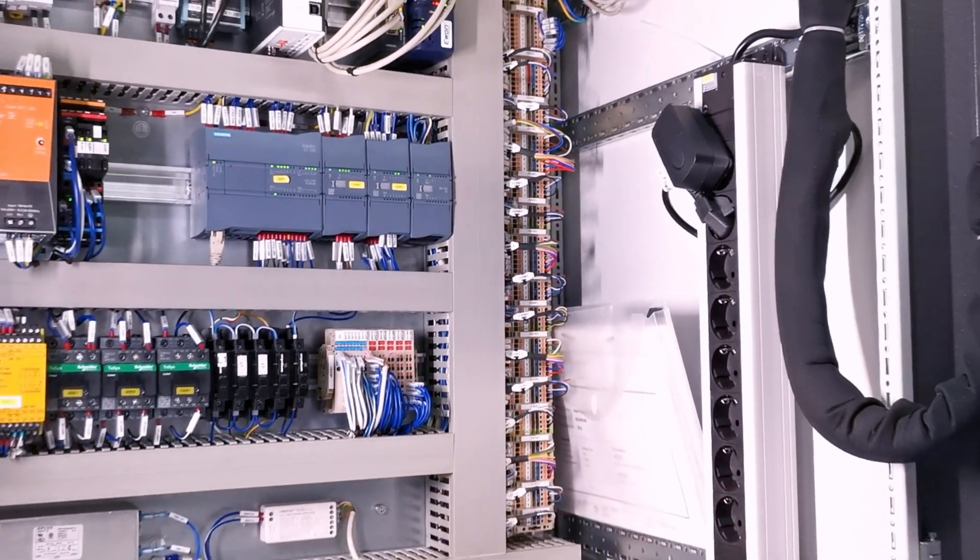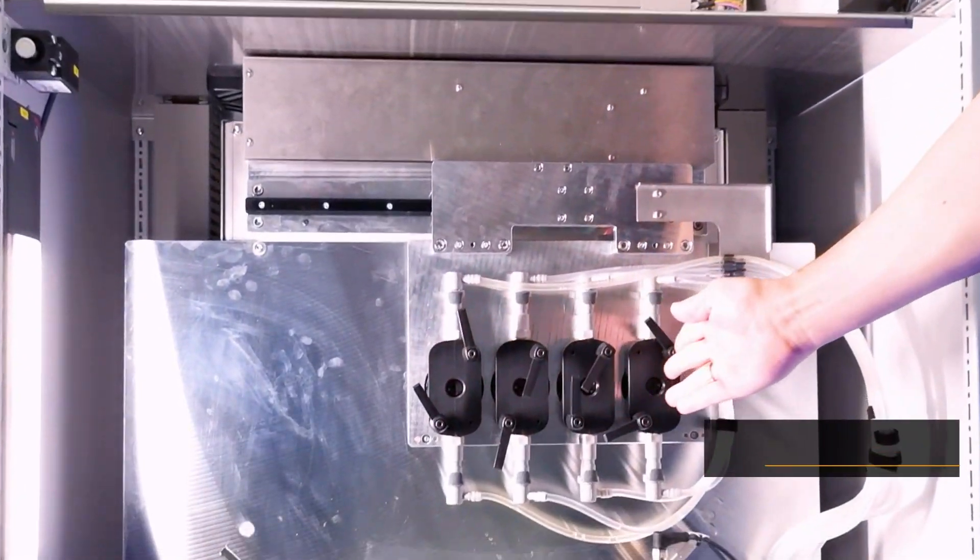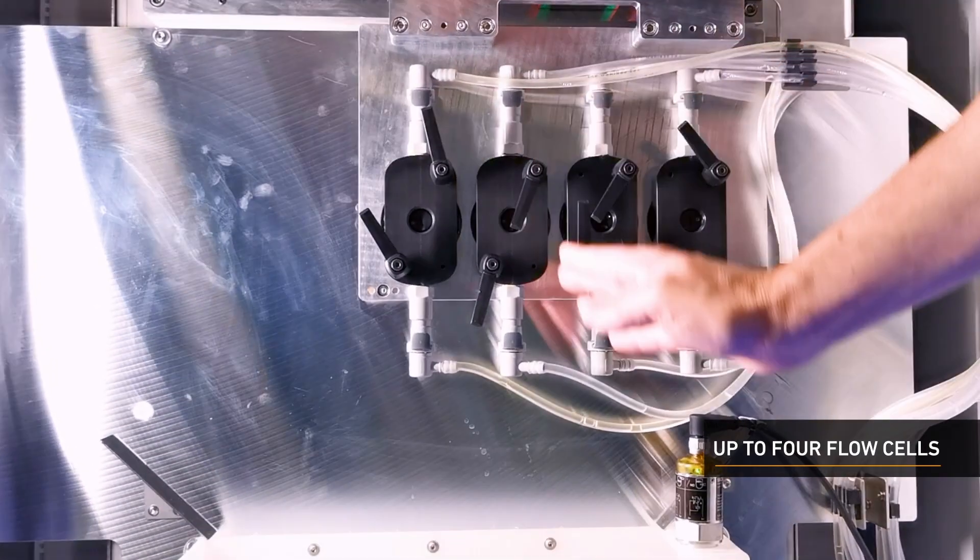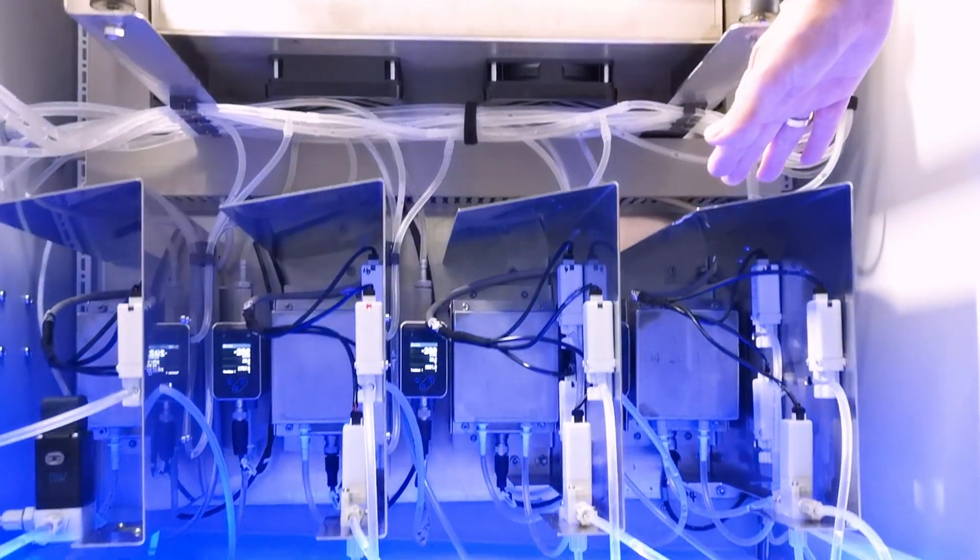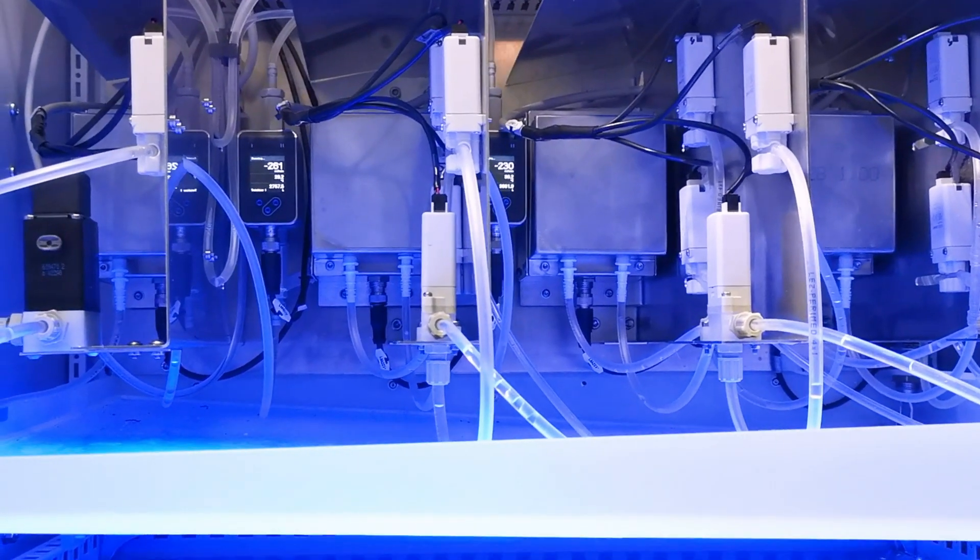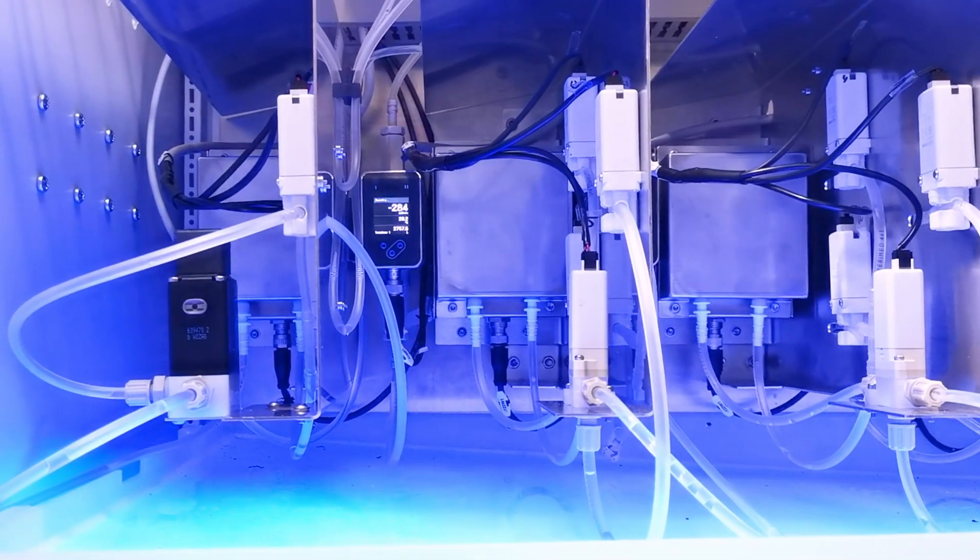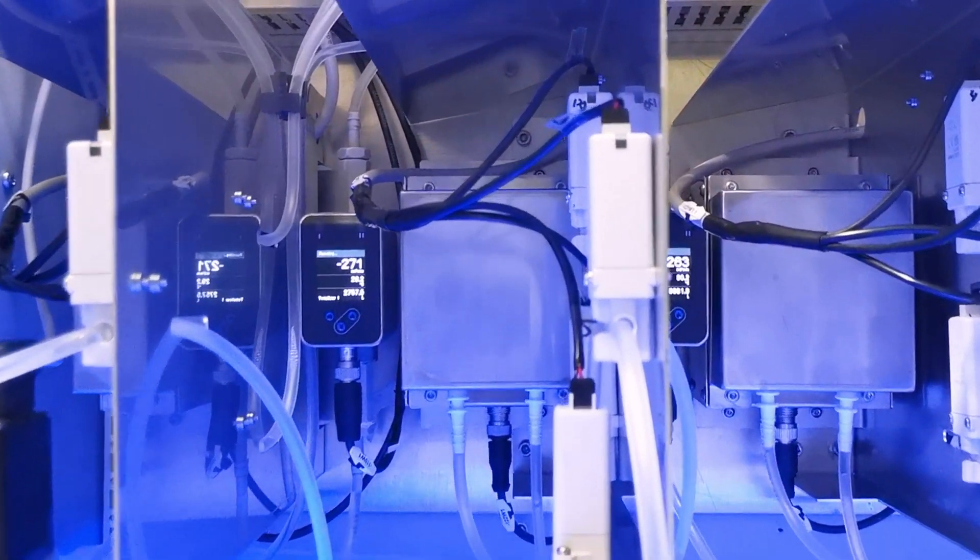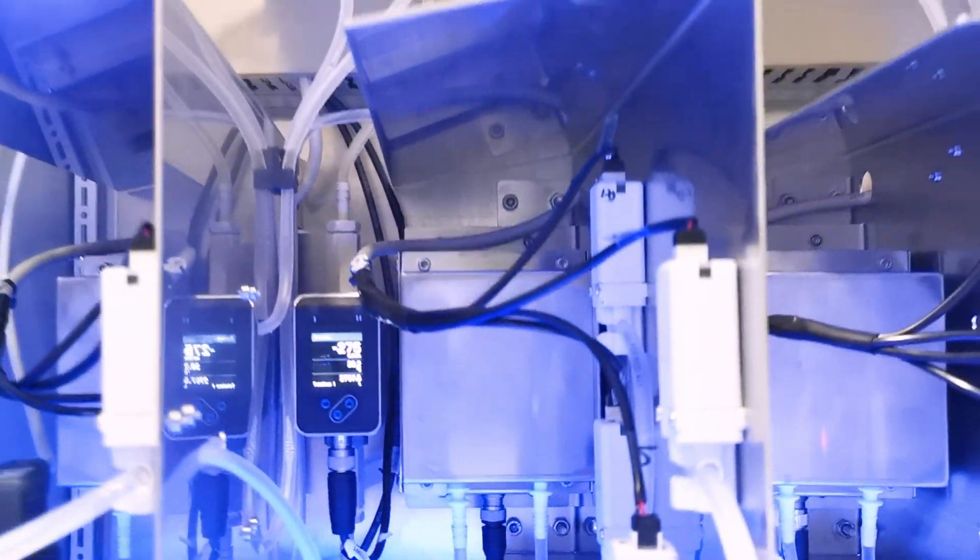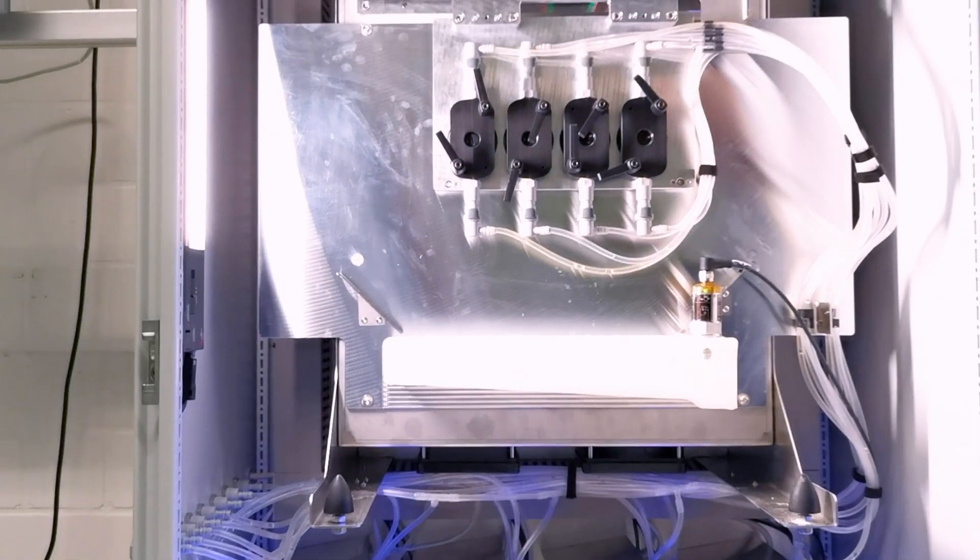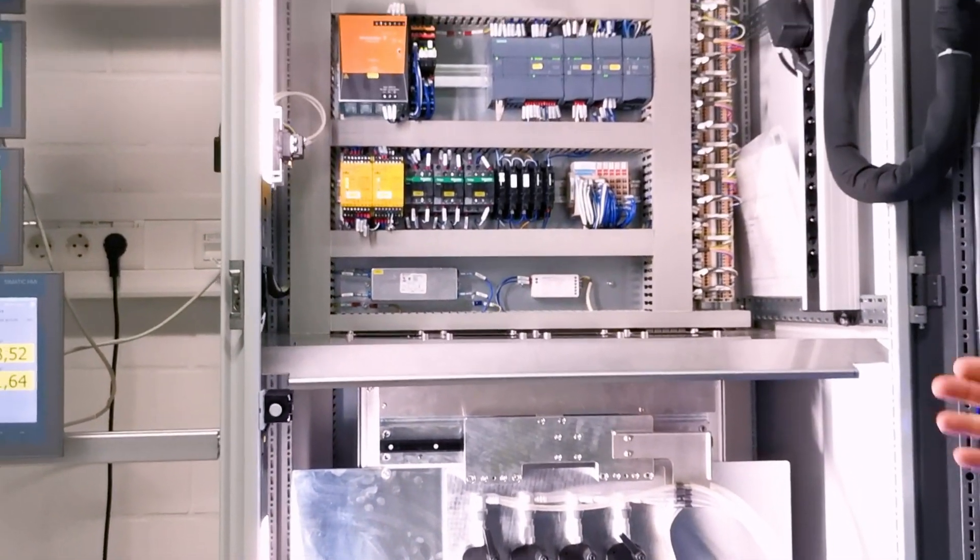In the lower two-thirds, we have the XRF with the four individual flow cells on this X-axis, leakage detection, and a drip tub. Four individual valve and pump assemblies pumping and switching and measuring temperature and volume flow of every individual channel. Most important here, we have completely separated tubing channel by channel to avoid cross-contamination and to be able to tailor the material selection of every channel.